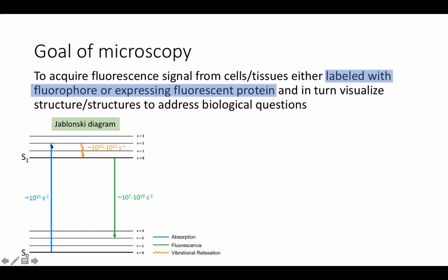It cannot stay in this excited state for a long time, and the electrons have to come down back to the relaxed state. However, when they do so, they go farther in the wavelength, and while doing so, they also release the energy, which results in fluorescence in a different spectra than we are used to seeing.